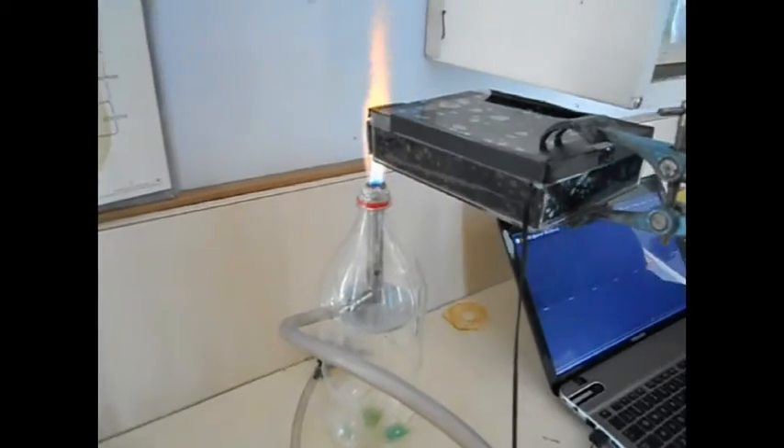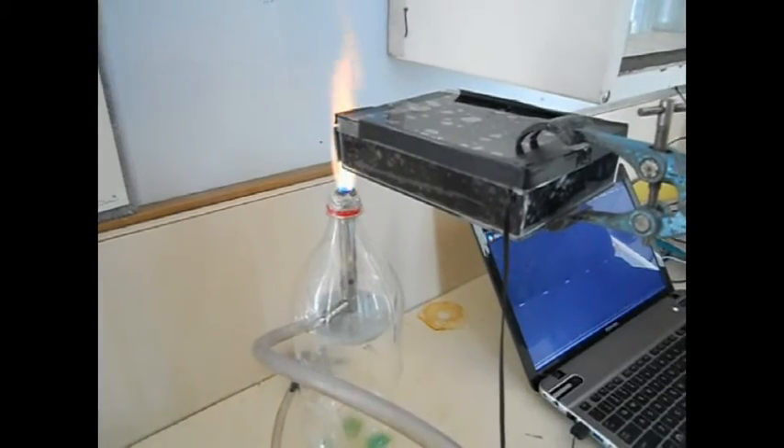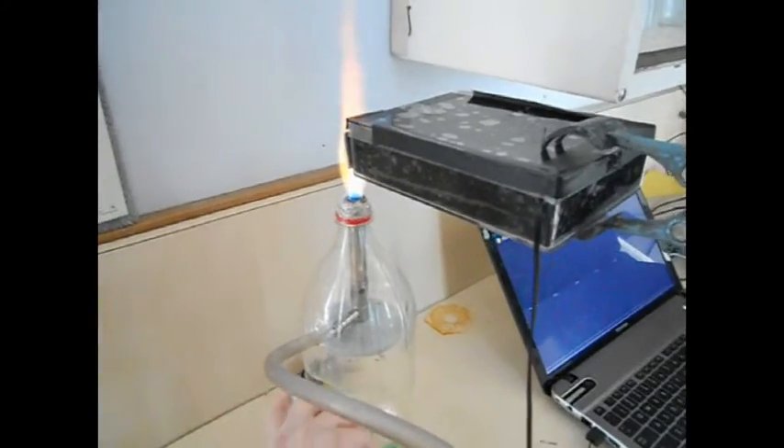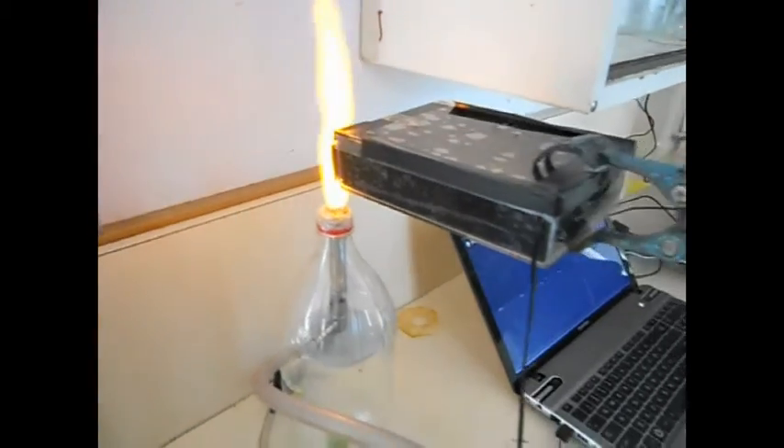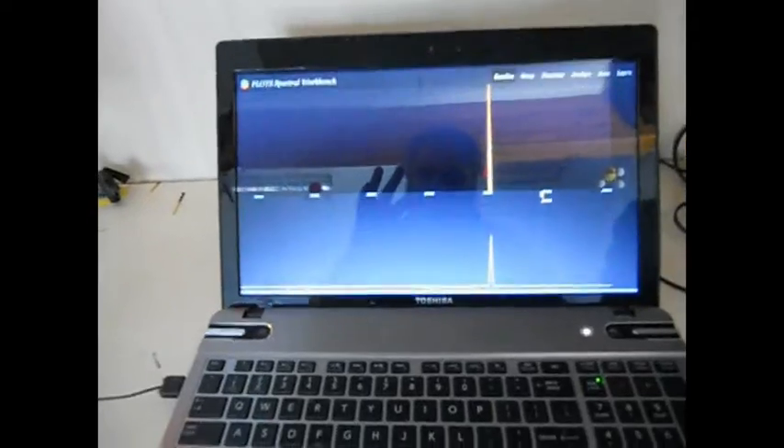Kelly's going to spray some sodium chloride into the aperture for us. We can see there that we get an immediate nice yellow flame, and that yellow flame is detected quite quickly and easily by the spectroscope.